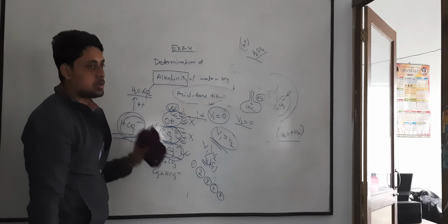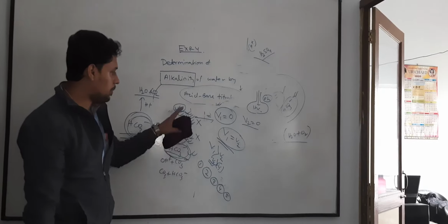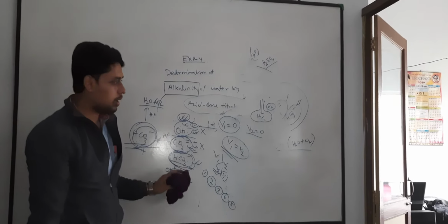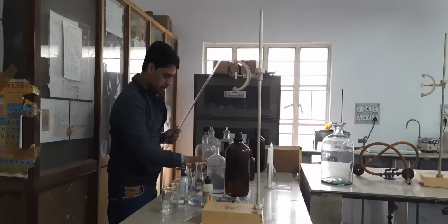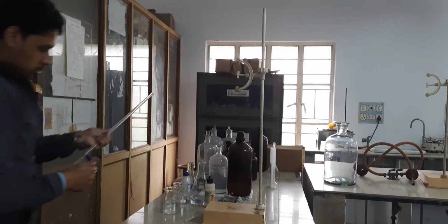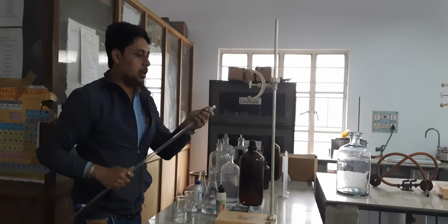So there are 5 possibilities, and we can check which set of alkaline substances is present in water after completion of the process, not before that. Okay. So now we will go through the process. Now we will start our experimental section.